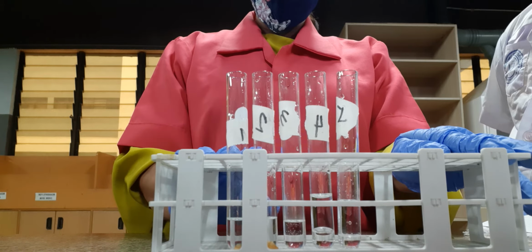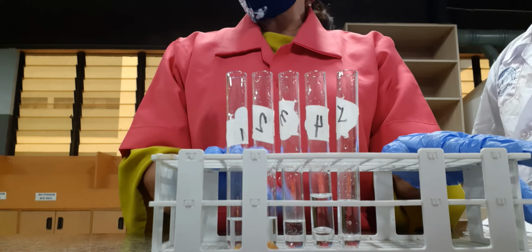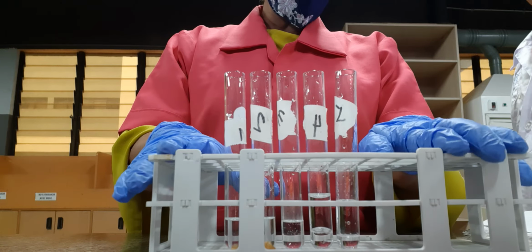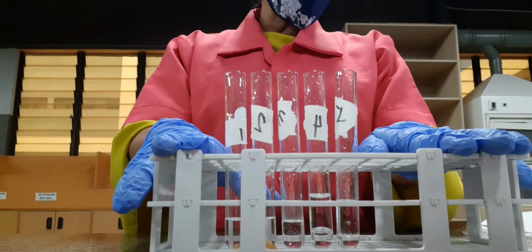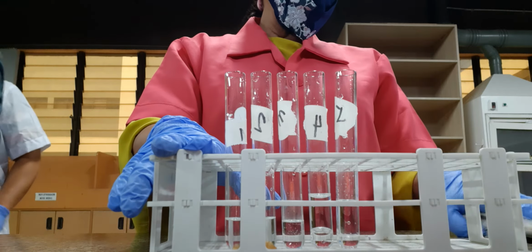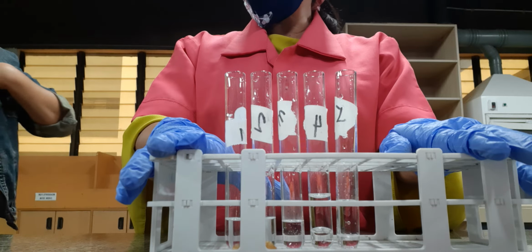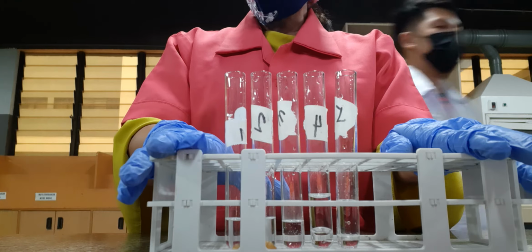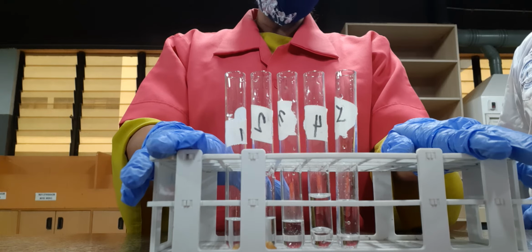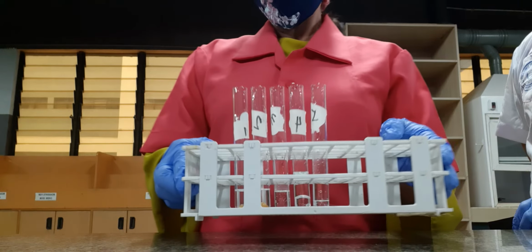So this is our test for miscibility with water. Our first 3 test tubes are soluble in water, and you know already the reason. The presence of an aldehyde will most likely dissolve because it can form hydrogen bonds with water, and the same with acetone because of the electronegativity of oxygen, which can easily bond with the hydrogen of water. So that is all for miscibility.